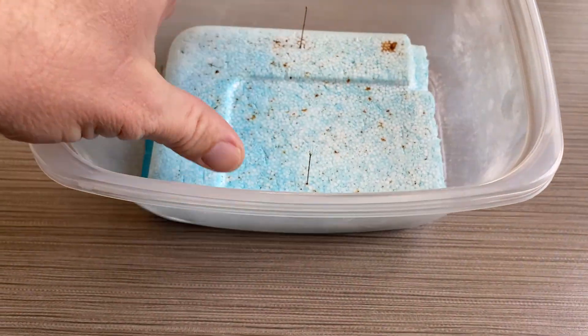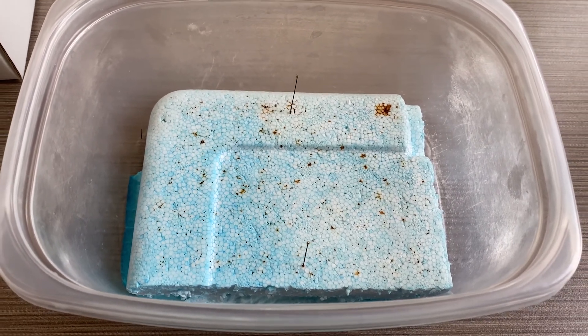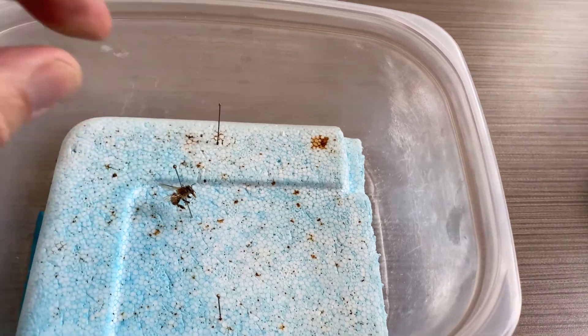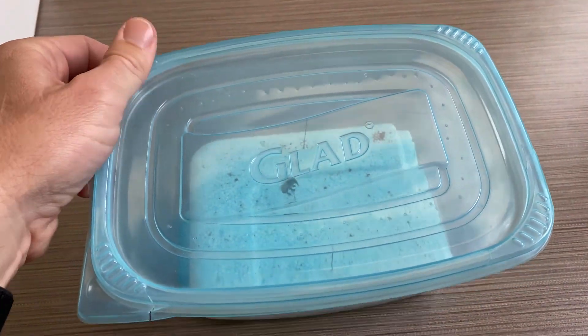Then I just put the styrofoam on top — we don't want the bee directly in contact with the moisture. Then I take our bee specimen, set it in there, put the lid on, and wait a couple of days.